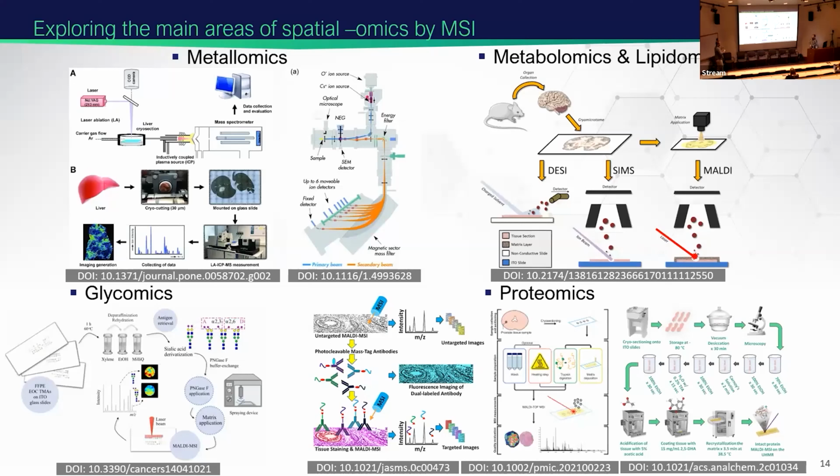Bridging in even further, we can go into glycomics, which we know that glycans actually attach to a lot of peptides as well as the actual proteins themselves. And we can go through a series of actual washes and then an actual on-tissue digestion in order to actually detect these glycans. And Dušan over here is actually an expert within this.